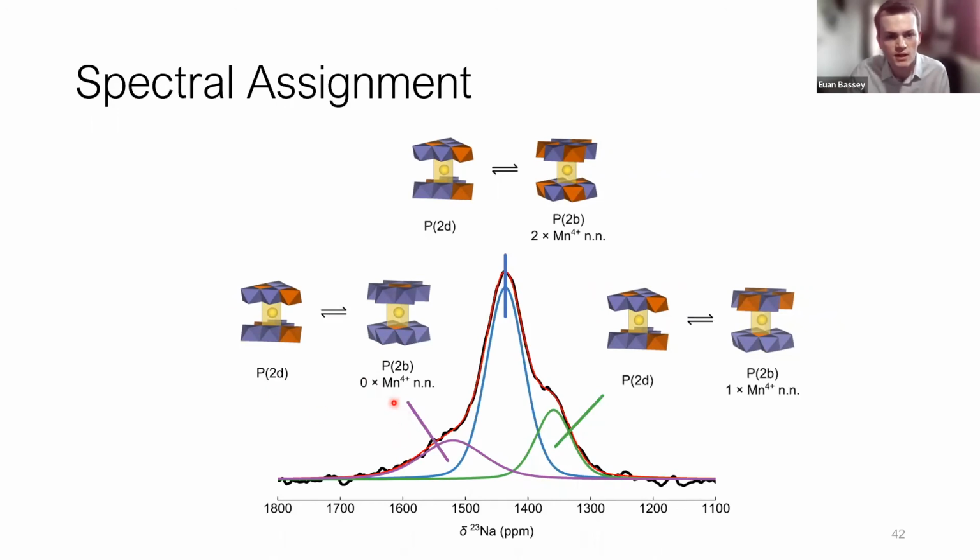The high frequency corresponds to sodium going between a P2D and a P2B with only magnesium nearest neighbors. The central one is the P2D to a P2B with only manganese 4+ nearest neighbors. And then this one is the stacking faulted hopping regime.